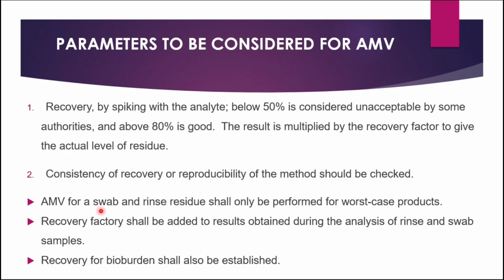Analytical method validation for swab or rinse residue shall only be performed for the worst case product. I have already explained this. Recovery factor shall be added to the results obtained during the analysis of rinse and swab samples. Recovery of bioburden shall also be established.